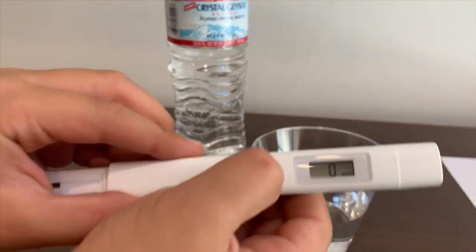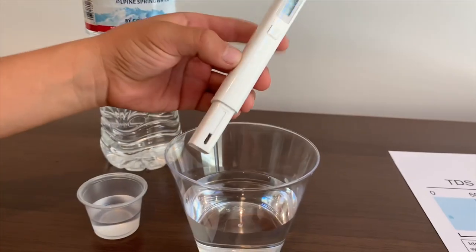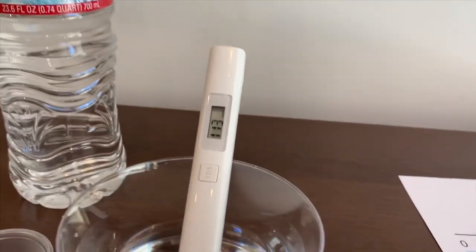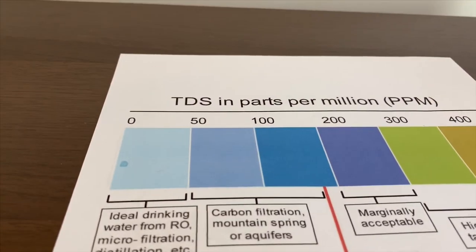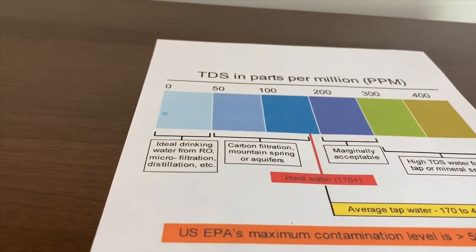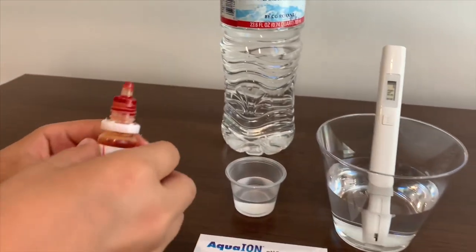Let's turn on the TDS tester. Make sure it's on zero. Let's put it in. It is 113. That is normal for filtered mountain spring water.